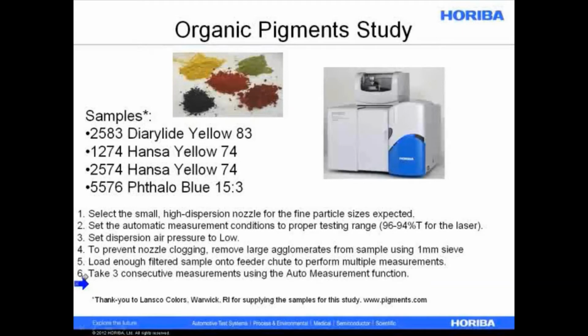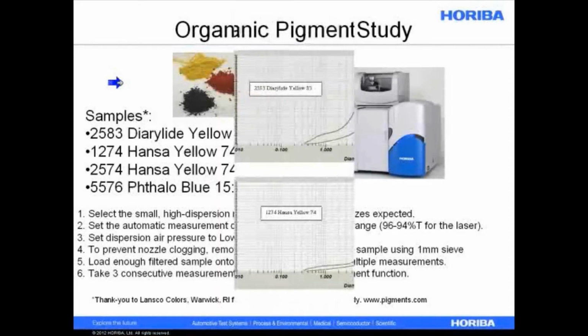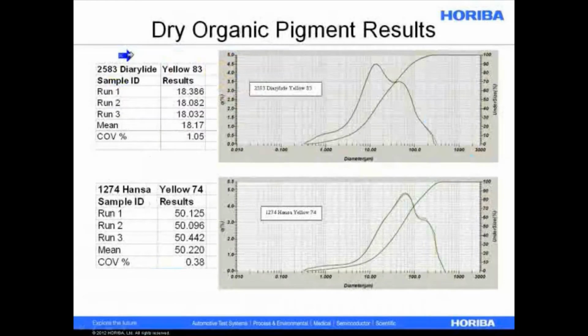Because when you use laser diffraction, that's the first thing you test to say, should I believe these results? Do I have confidence in them? We look at the reproducibility of results, or repeatability. With powders, it's always reproducibility. And that gives us some indication of what we think of the data we generated. So now I'll show you some of these results.